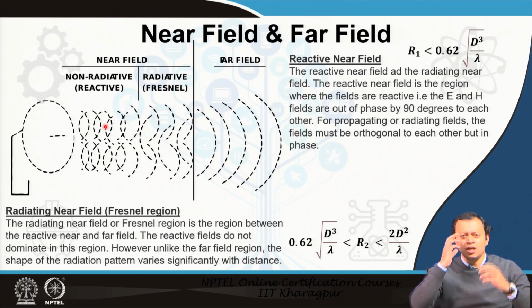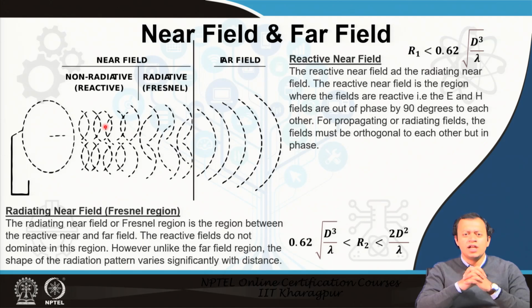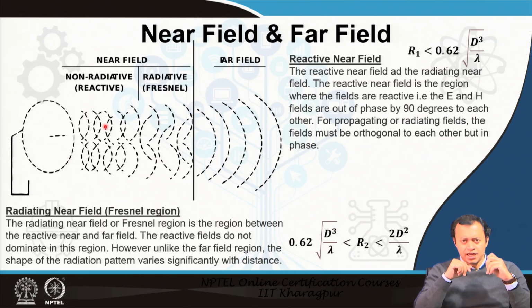Whenever light comes, if you have looked at total internal reflection, or at optical fiber, when light is completely reflected, a very tiny 0.01% of the light actually goes into the forbidden region, the area from which it is supposedly 100% reflected, right.